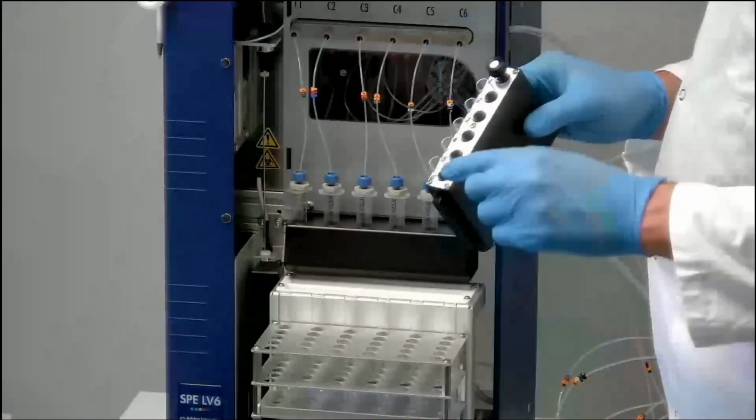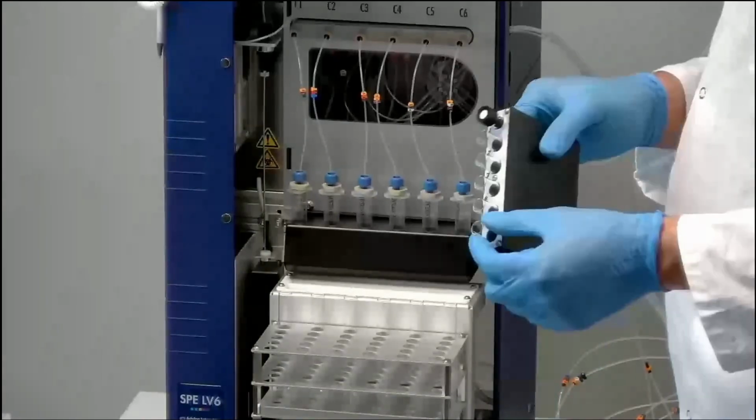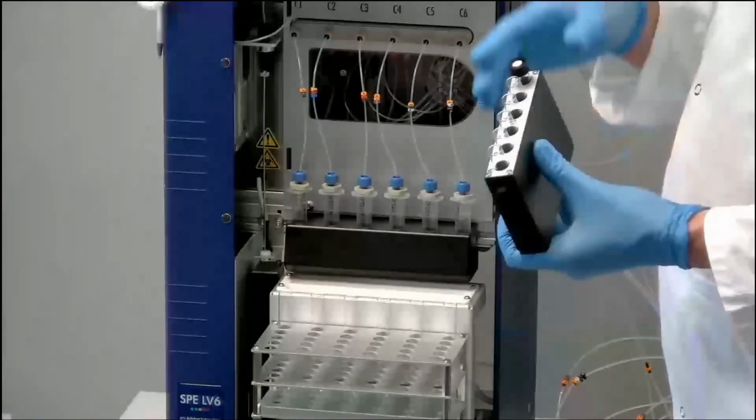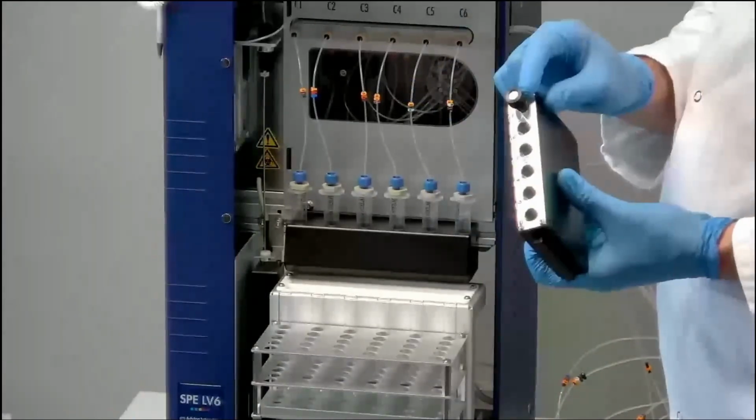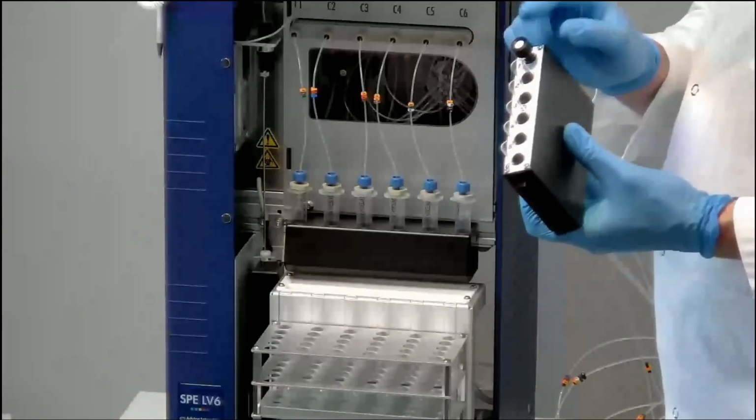We can use test tubes, classic test tubes that you can have inside your labs, but you have another possibility: to use this type of vials with a screw and a septa inside the caps.